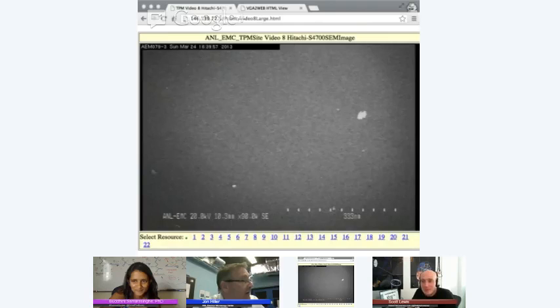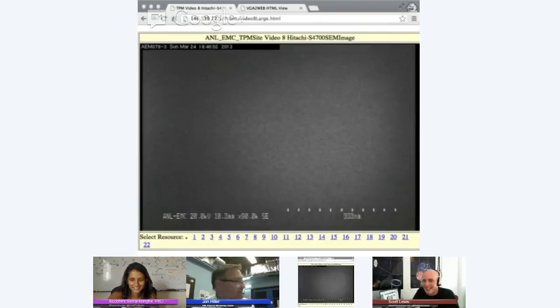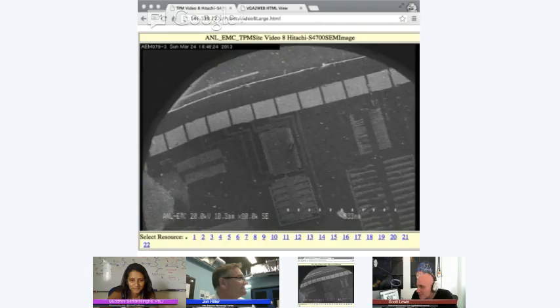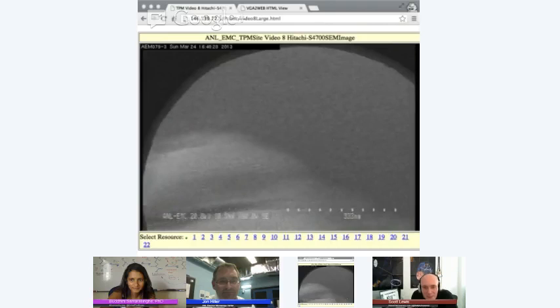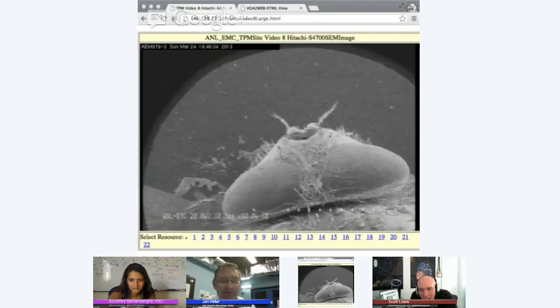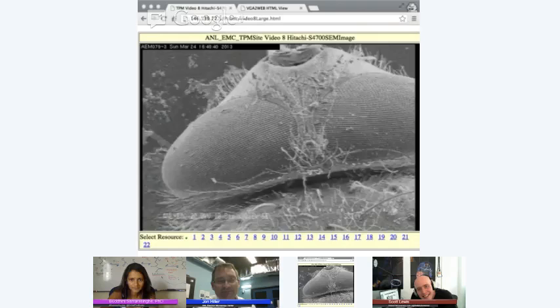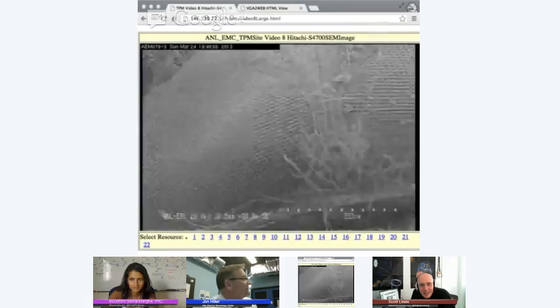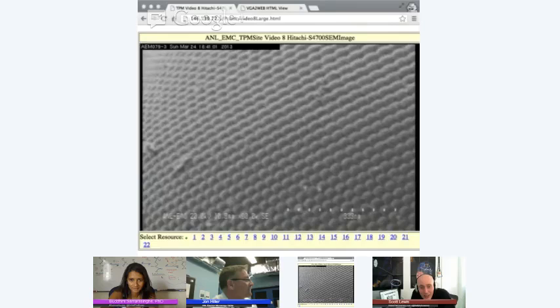Let me go to something. I told you I don't do biologicals, but I try. Right. I try. 13.1. All right. Let's see if anybody can figure out what that is. This is where you always see the cute electron micrographs on the internet that are colored all kinds of funny ways, such like that. Is that a fly? That is a fly. Wow. That is a fly, and those are fly's eyes. Oh my God. That is so cool.